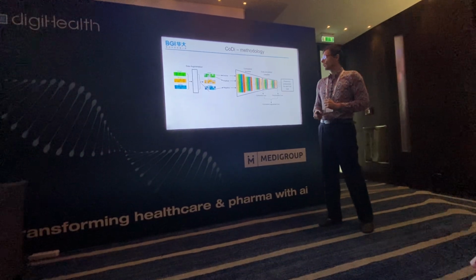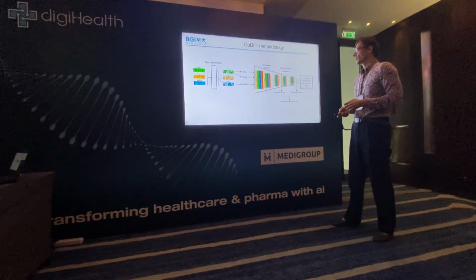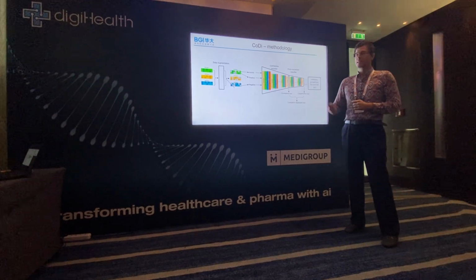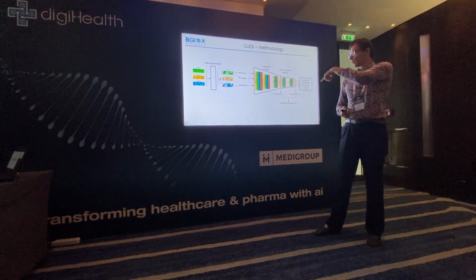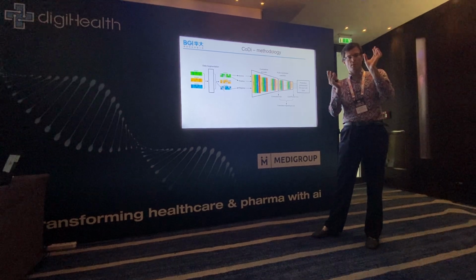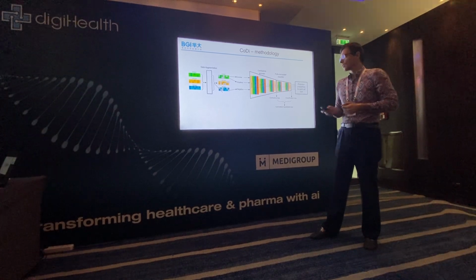Under the hood, this diagram shows what the architecture of this encoder looks like. The first step is data augmentation. As I showed in the histograms three slides before, the distributions of the data that we use for training and for inference are different.